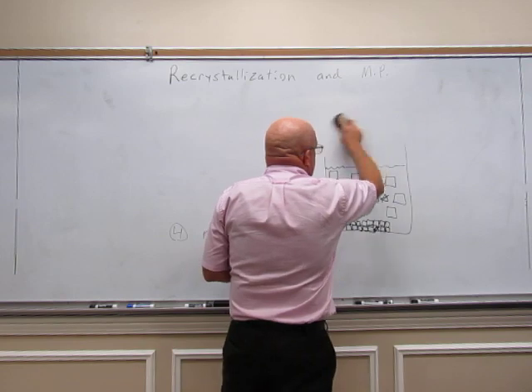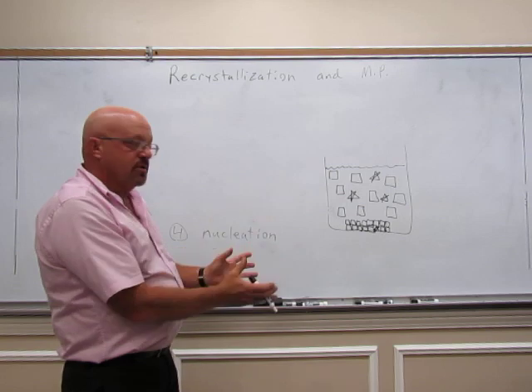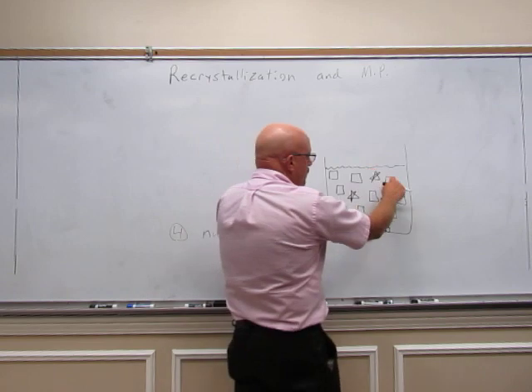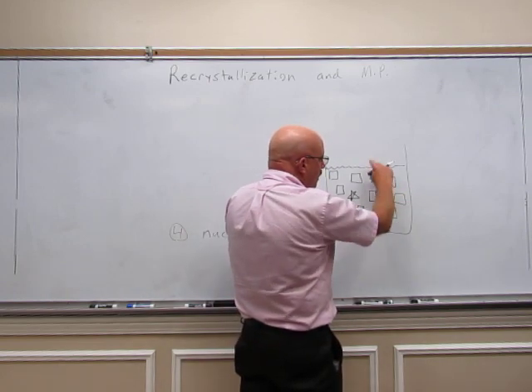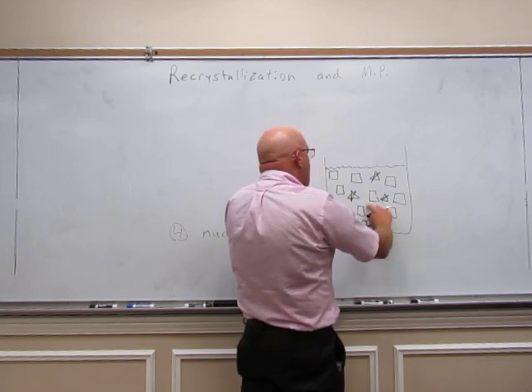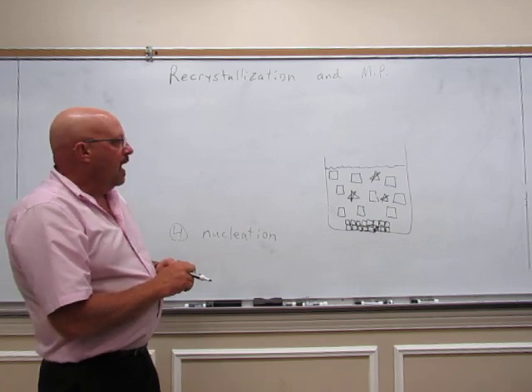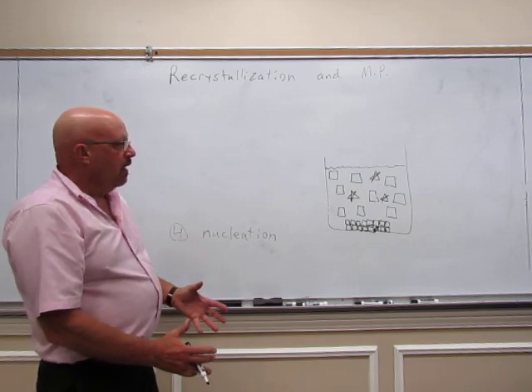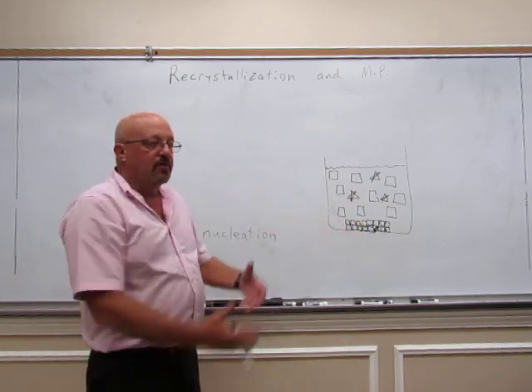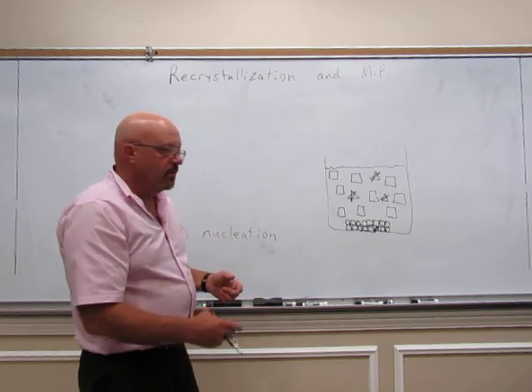as we recrystallize. Now, it is important when we go to recrystallize to let it cool slowly. We want it to cool nice and slow, so that these will have time to come on and off, on and off. If a star comes in here and tries to fit, it has time to come off if you let it cool slowly. If you cool it quickly, then instead of a crystallization, it just precipitates. It just falls out. It's a precipitation rather than a crystallization.